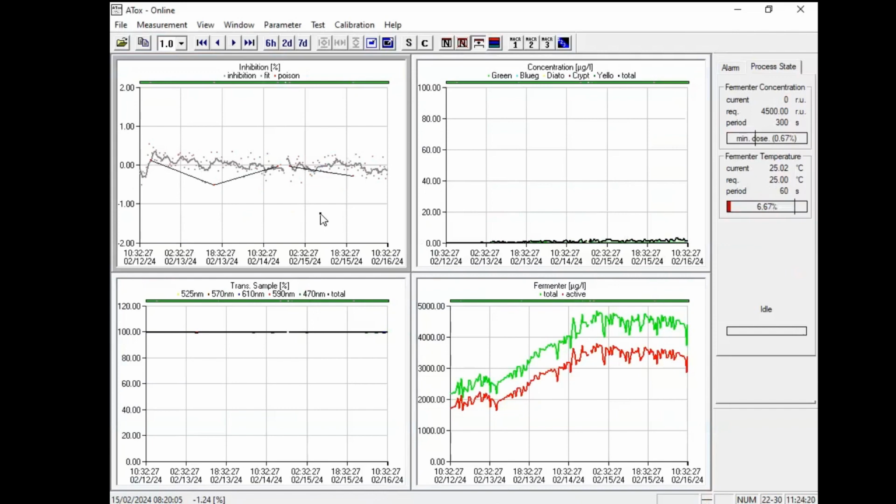So the deionized water may work, but the problem with the reference water is the reference water is also used for cleaning, rinsing, and separation of the different waters.